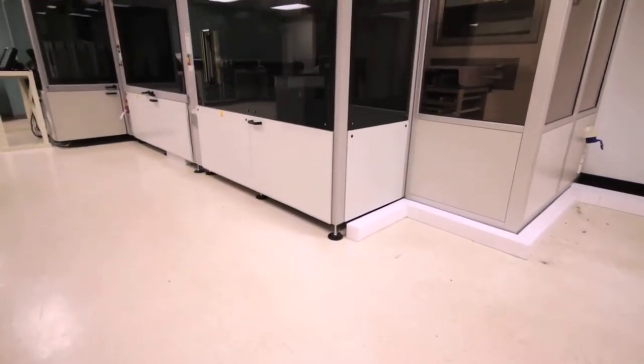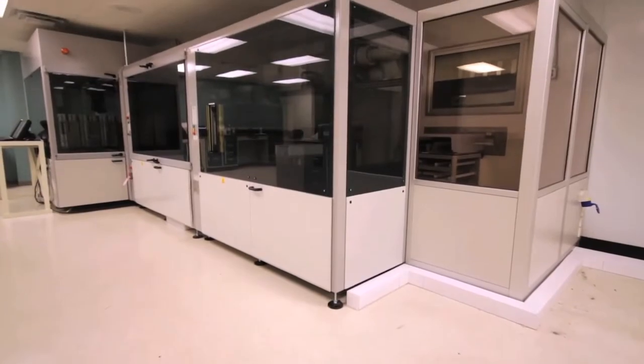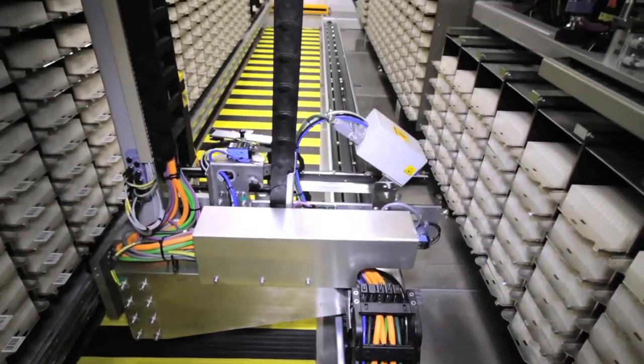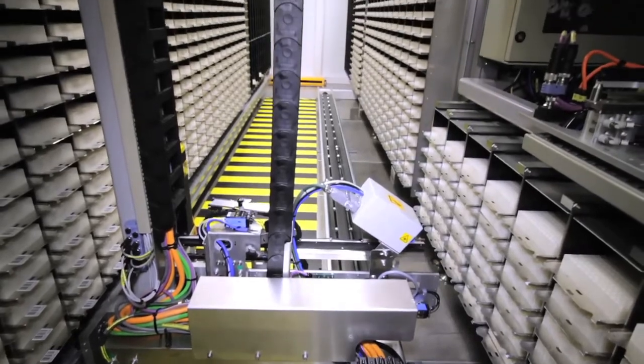This solar dizygotic system utilizes two floor-track mounted transfer robots. The first is mounted inside the home base freezer to handle the microplates or tubes to and from the storage racks.